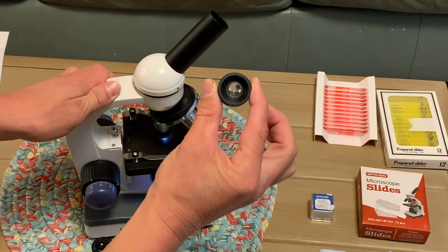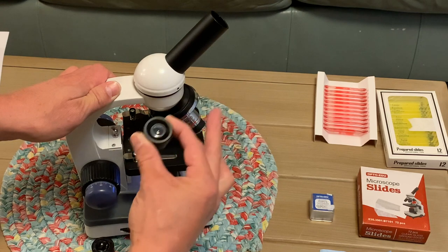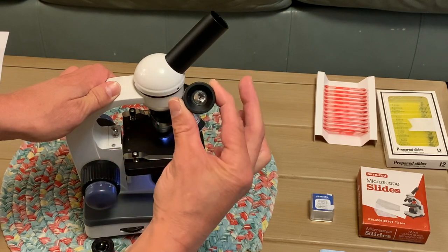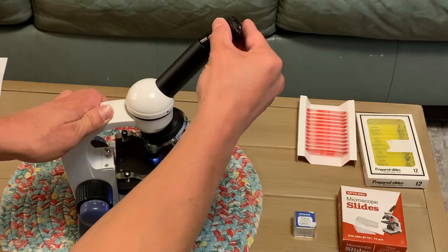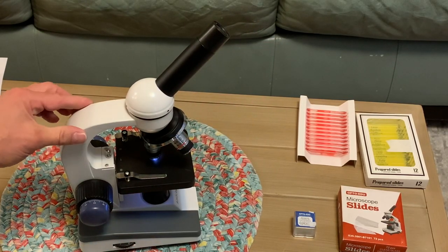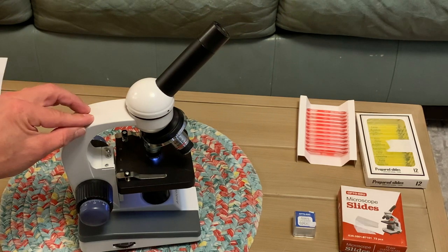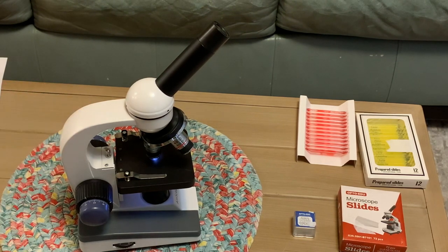Then you've got this other lens which is a 25x magnifier, so it will magnify these objective lenses 25 times — up to a thousand times magnification. In the slides I'm going to show you I did use just the 10x eyepiece, so 400 magnification was the most powerful view used in the videos I'm going to show you.